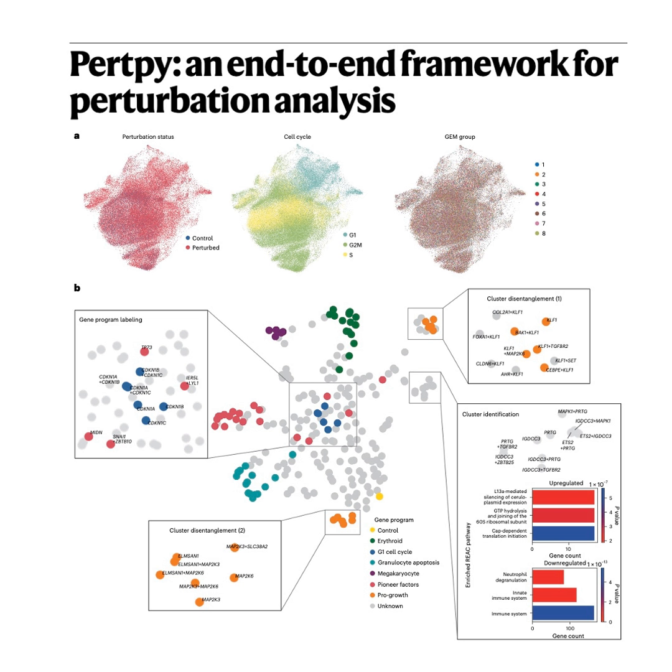Exactly. Pertpy is designed to bridge that exact gap. It's an end-to-end modular framework built in Python, and it's aimed squarely at organizing, analyzing, and visualizing these massive experiments. It sounds like a pretty big promise. Yeah. What makes Pertpy scalable where other tools have failed?